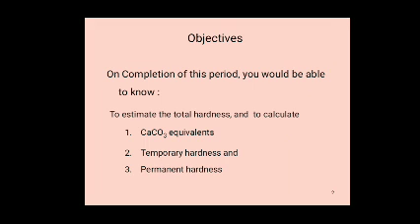Degree of hardness of water is expressed in terms of CaCO3 equivalent. 100 parts by weight of CaCO3 is equal to 162 parts by weight of calcium bicarbonate.